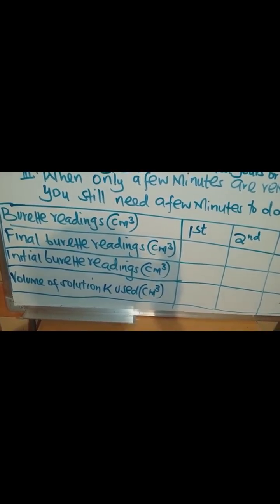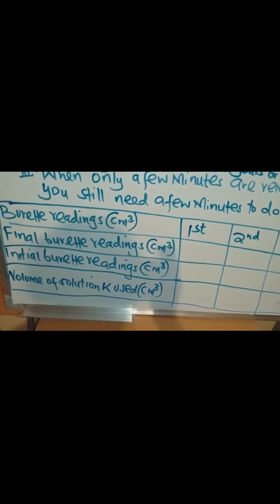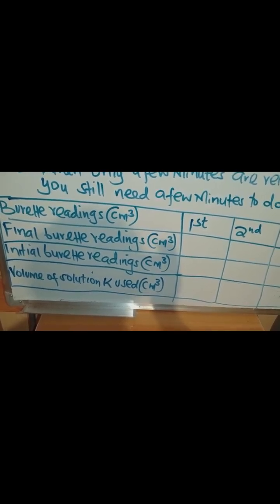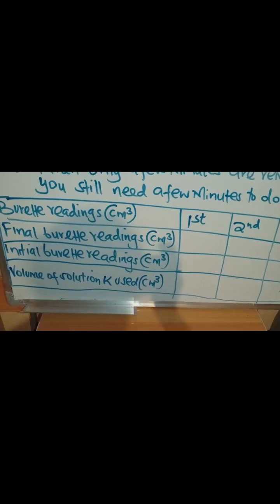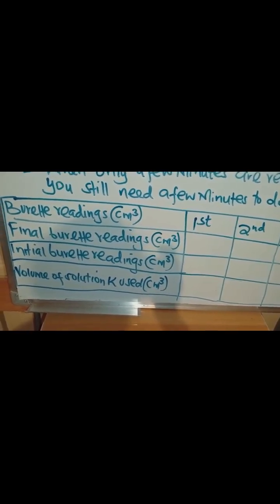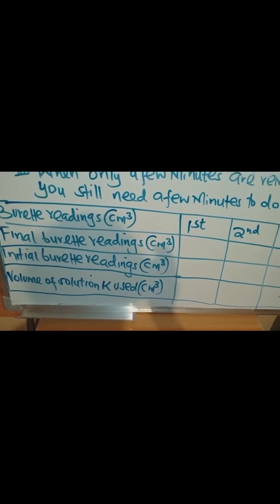Then lastly, down there we have the volume of the solution to be used, and it will be very necessary for you to indicate the name of that solution. And in the name, I mean the letter that has been used to name that chemical, maybe solution A or solution B, solution K, whatever. So that one, you don't just cram, you read it from the procedure that has been given.